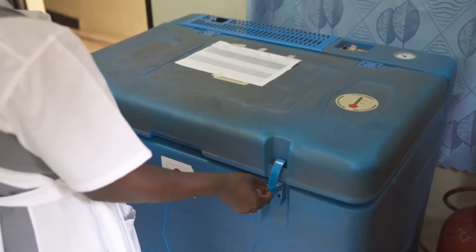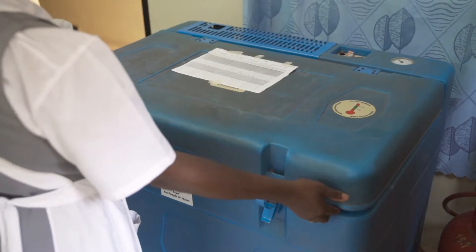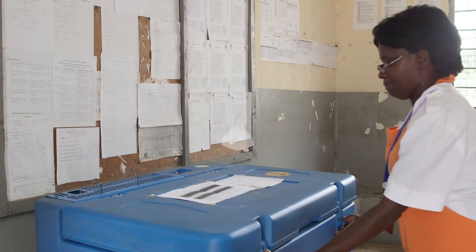No matter which type of refrigerator your facility uses, it is important to know how to arrange vaccines, diluants, and water packs inside to keep them at the right temperature.